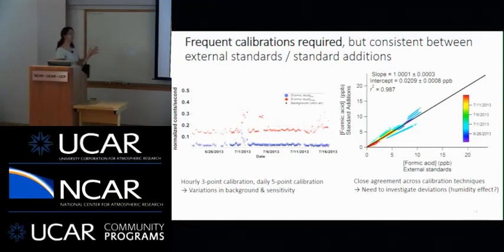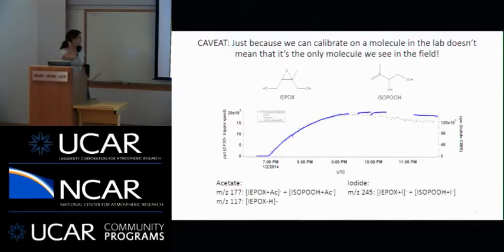Fortunately, if we calibrate the instrument with these external standards and standard additions, we get the same numbers. That's what this figure over here shows. So if we did formic acid from external standards and standard additions, if we use these two calibration techniques, we have a pretty good R-squared value of 0.99. We're looking at no biases. And that's what this says. If you use standard additions and you get the same data, we have no bias in our instrument. Okay, so that's good. So we can calibrate formic acid.